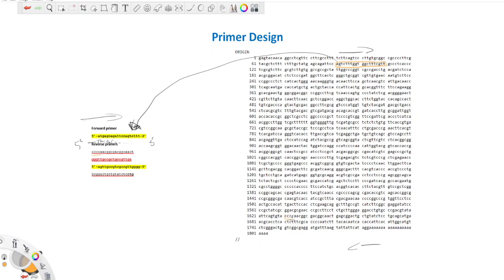4 cytosines, and we have a region up to ACT. Okay, so this is what I selected, but in fact I was supposed to go up to this point again, but it's fine. We can just redo that quickly. While we are on it here, I'm going to take that region and show you how we do it. I'm going to remove this one, and maybe let me keep this one as well, like this.